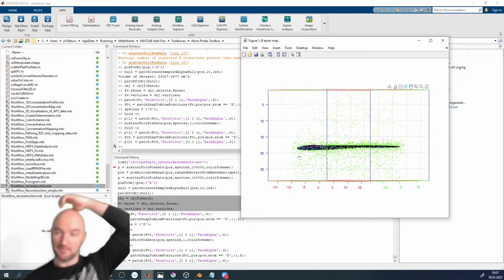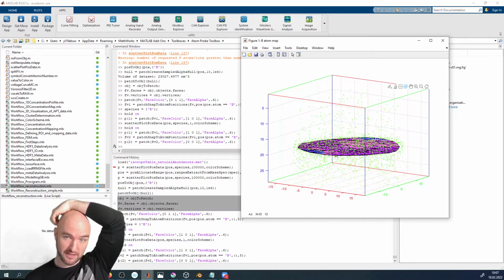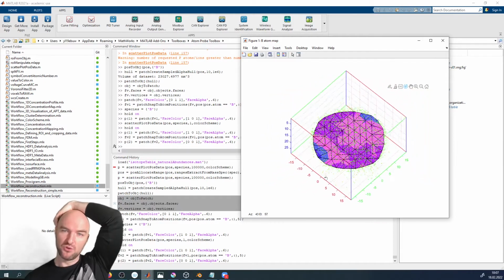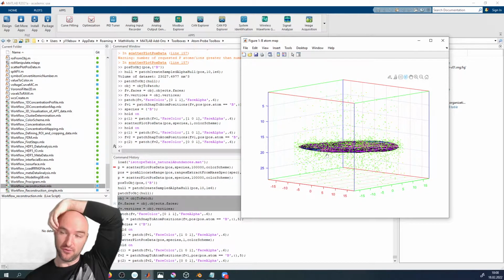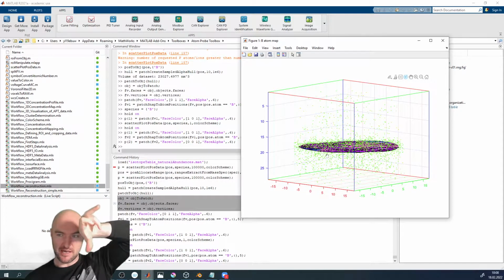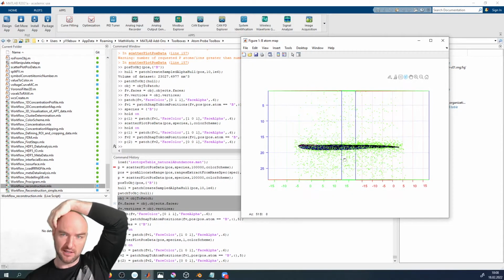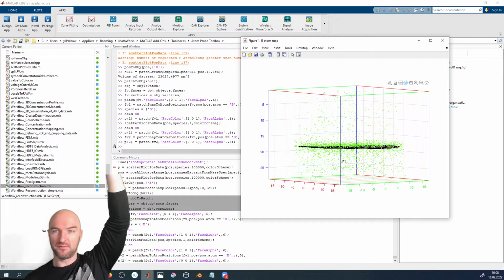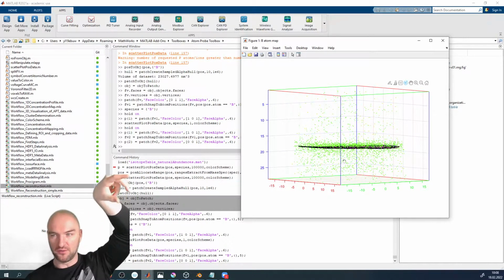By the way, very similar algorithms are used in finite element analysis to create finite element meshes, and they usually use something called an energy criterion for convergence. So you sum up the square of the displacements of the vertices during the algorithm steps, and if the square of the displacement falls below a certain fraction of the first step, usually about 5%, then you call it converged.